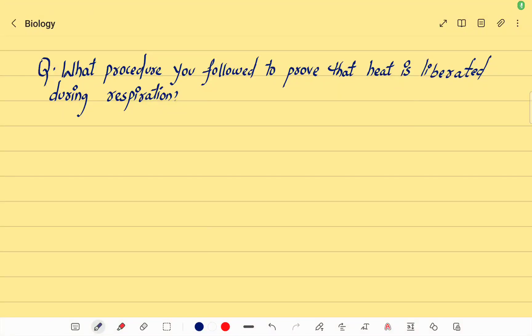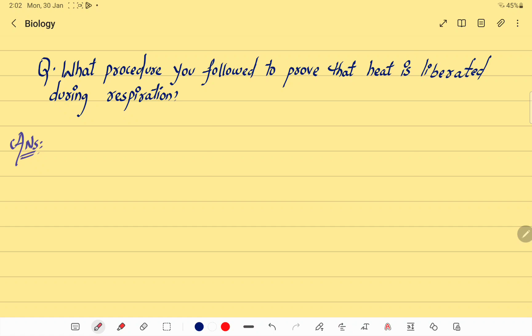Welcome students. Today's topic is biology and we are going to learn about an activity. The question is: what procedure did you follow to prove that heat is liberated during respiration? So let's perform this activity.